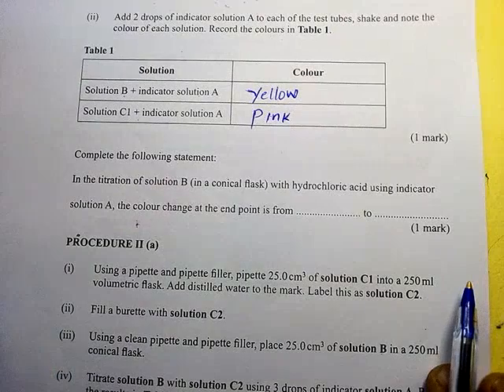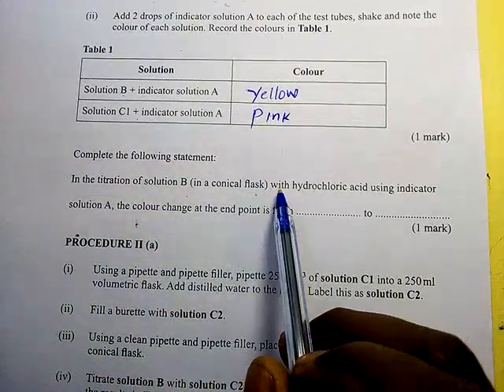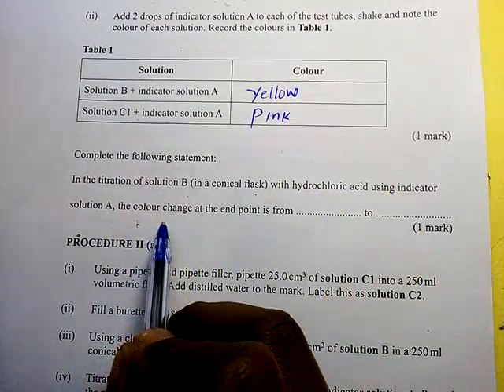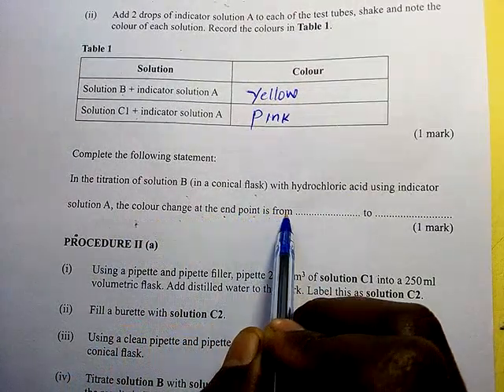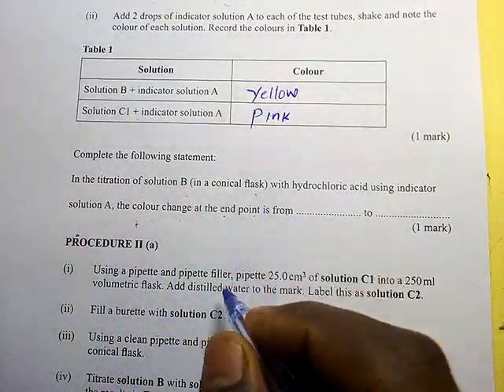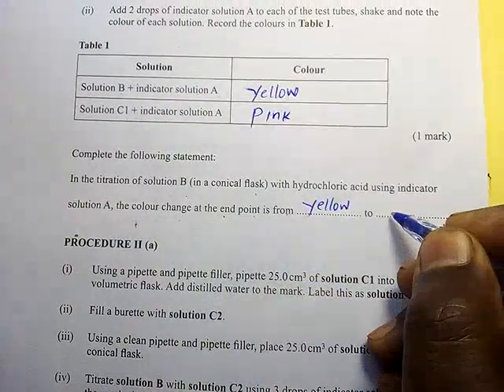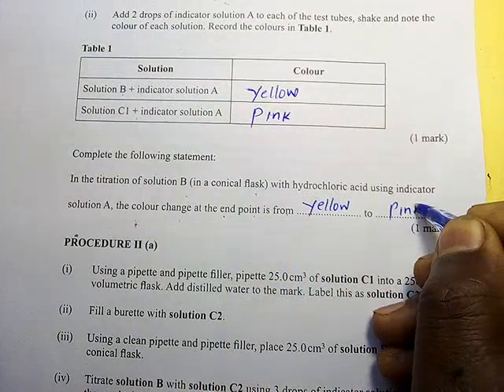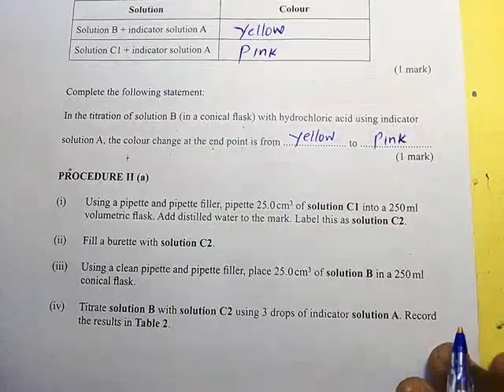Complete the following statement. In the titration of solution B in a conical flask with hydrochloric acid solution, indicator solution A, the color changes at the end point from yellow to pink. So these are the 3 marks that the students were supposed to get. Procedure 2.